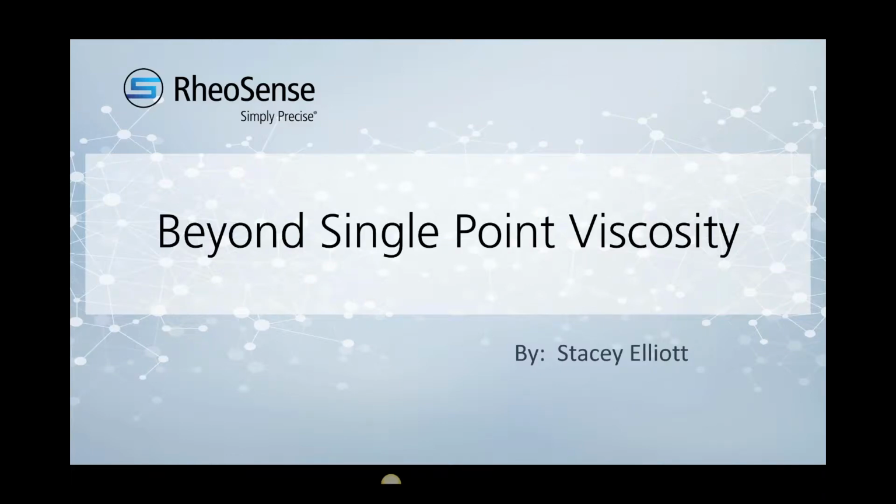Okay, welcome everyone to our latest webinar where we're going to talk about how viscosity measurements are not just a single point and that you can go beyond the single point and get much more information that could be very relevant to your systems. So when we announced the webinar, we sort of highlighted the fact that we're going to talk about the importance of temperature dependence on your viscosity.